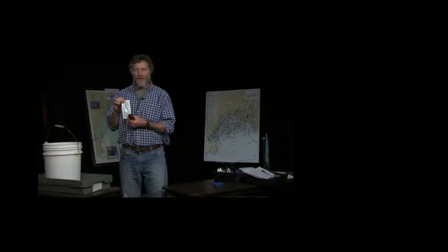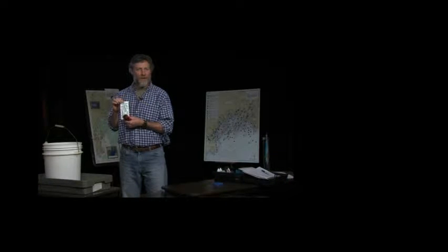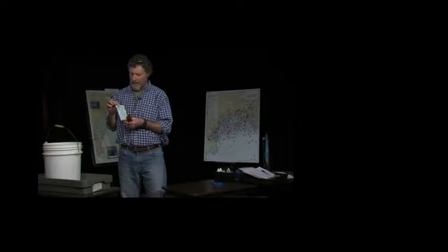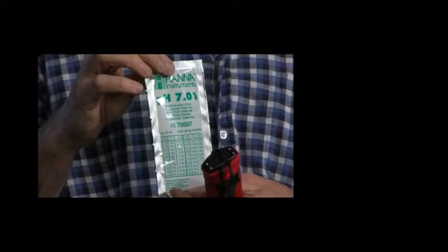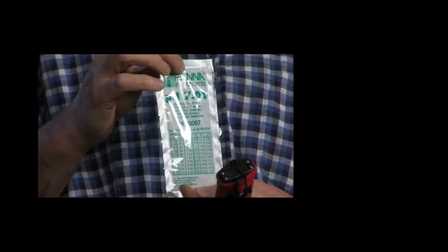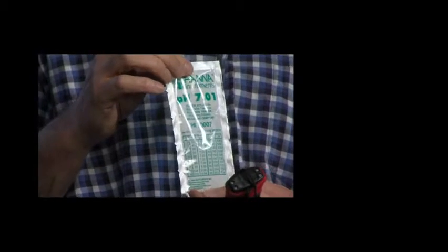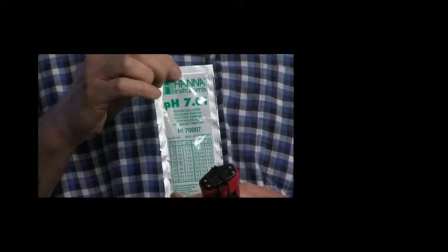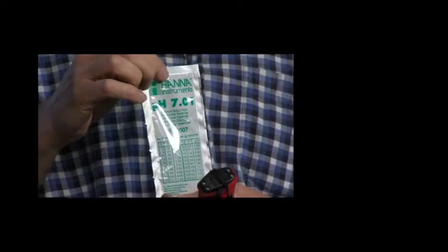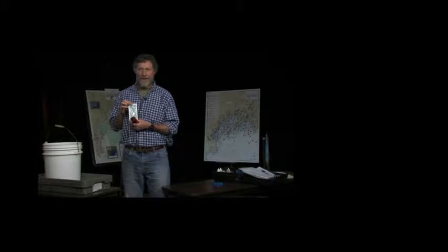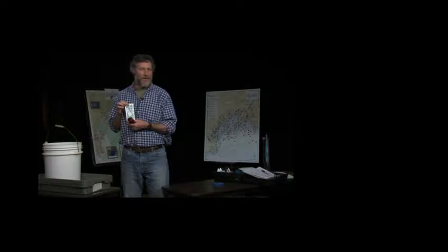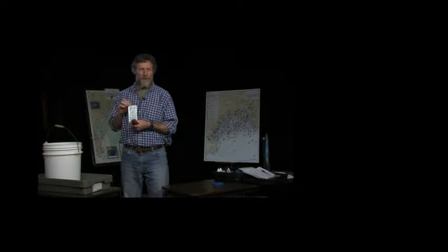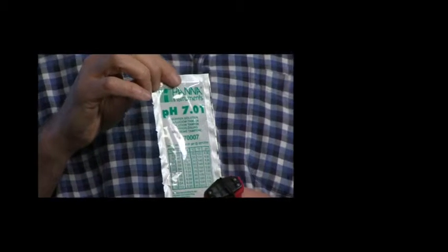There's also a solution that's a 4 and a solution that's a 10. We like to use the 7 because it's sort of in the middle of the scale for pH and it's fairly close to what we measure or what we see in the ocean, which is typically around 8 or the upper 7s for pH.